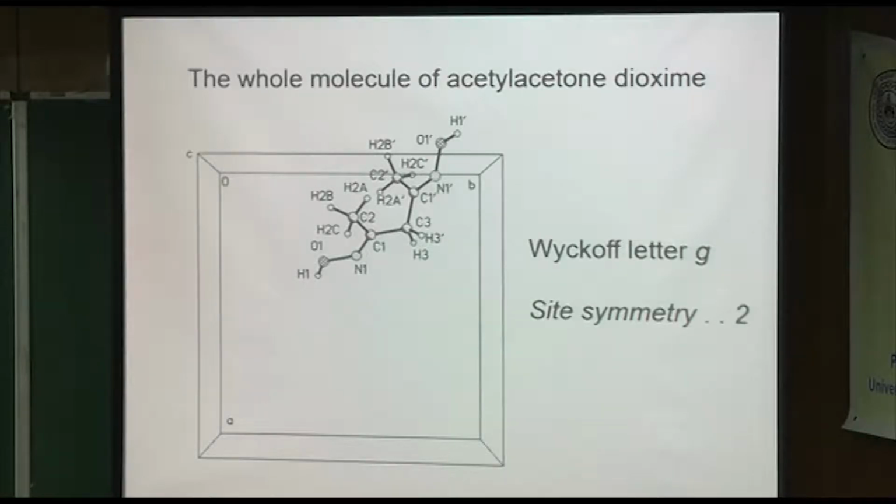So you see where C3 is there? And I've just numbered it so that the ones that are generated by symmetry are primed. But yeah, so right around here it rotates. It's kind of hard to see it there, though. Anyway, there'll be lots more examples like that.